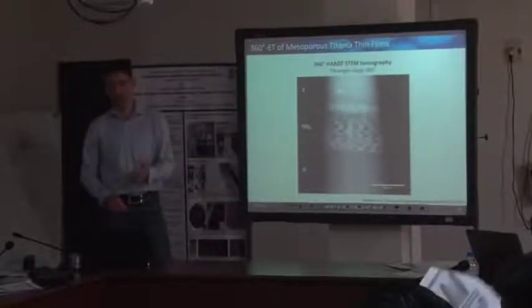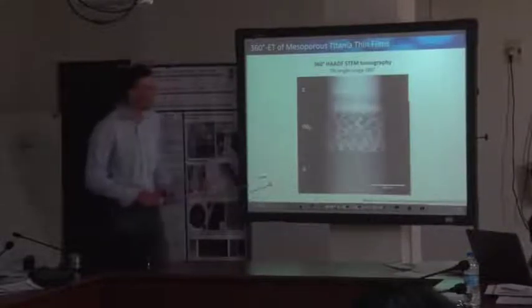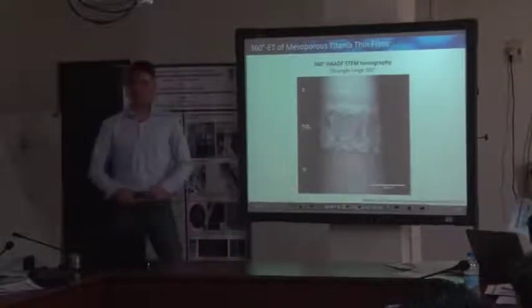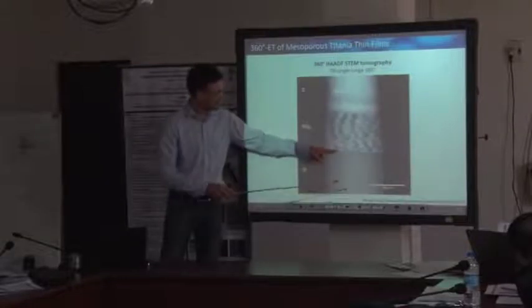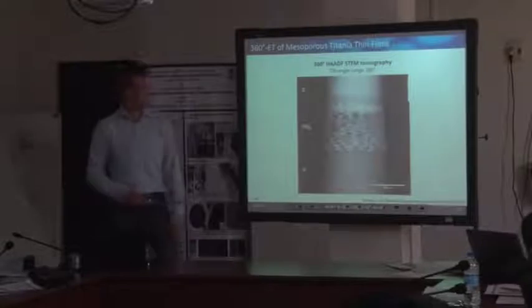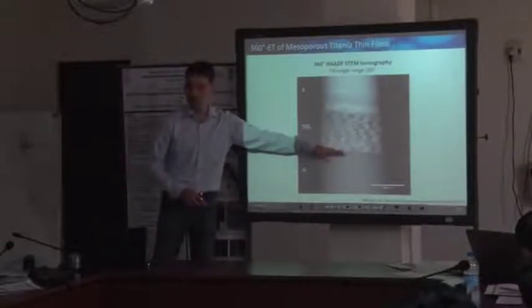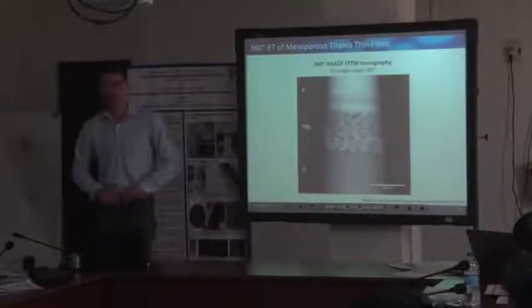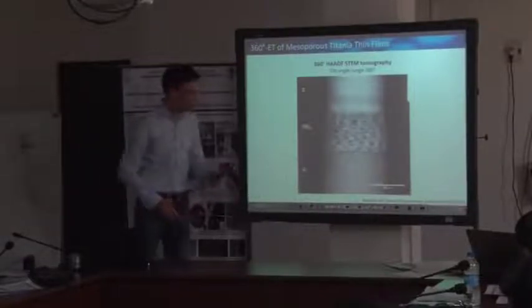There are no videos in the printout. Unfortunately, there are many in the presentation here. But nonetheless, in this particular case, we make use of the fact that we know the crystal orientation of the substrate. We clearly see this very thin layer of silicon oxide on the surface. So we could even align that almost perfectly parallel to the electron beam in STEM mode. And this is the data set that we use for the reconstruction of the 3D distribution of the pores within the titanium oxide. Okay?